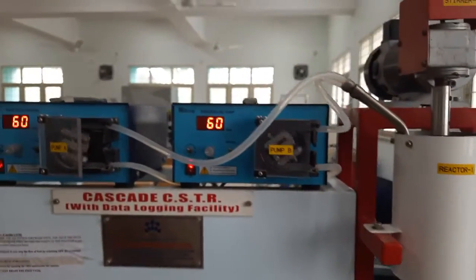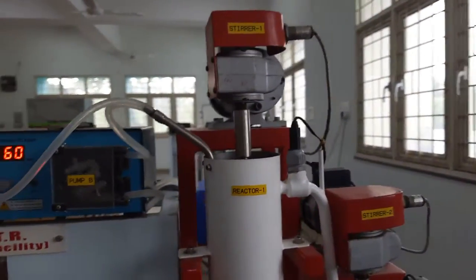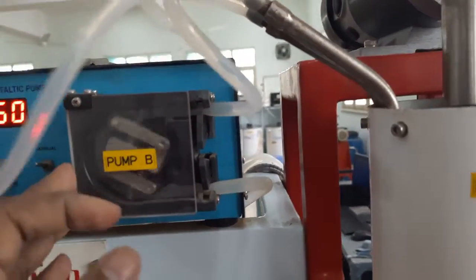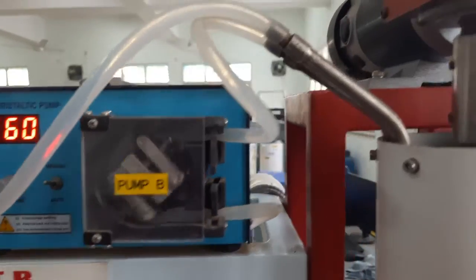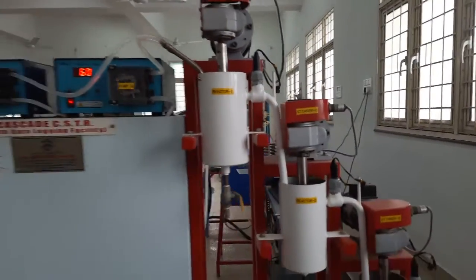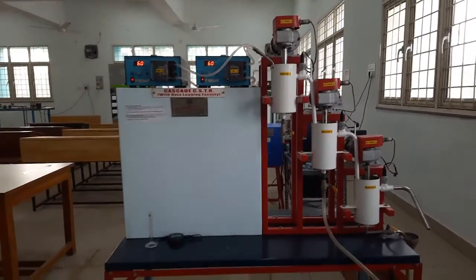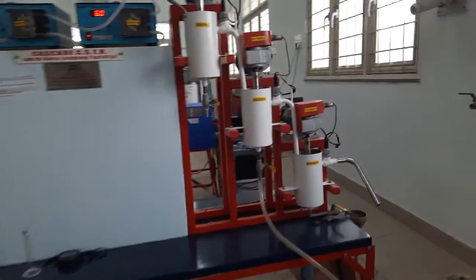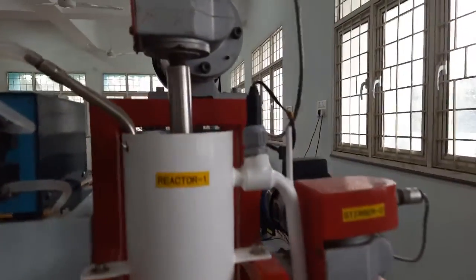This is only to ensure how much time it is taking for steady state to be attained. Okay, as you see, if any air bubbles are there, we have to check. It will take certain time for the fluid to enter into the tank. Wait for some time. We are keeping all the 3 CSTRs.